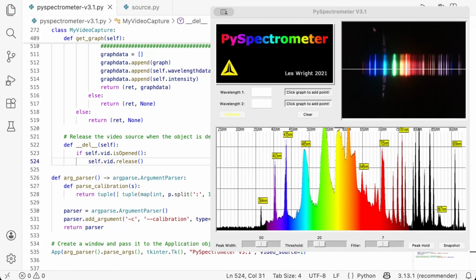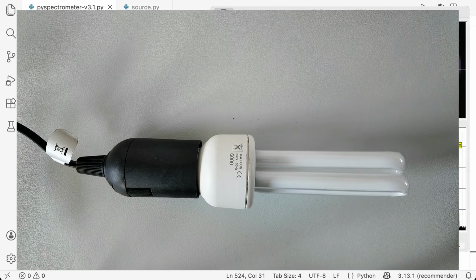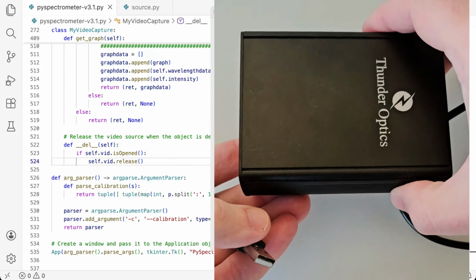Our world is full of surprises. For example, did you know that the commonly used fluorescent lamps look white, but actually they have a lot of gaps in their colors? In this video I will combine some programming and some science. I will show how to connect a USB spectrometer in Python and we will make some fun experiments with that.